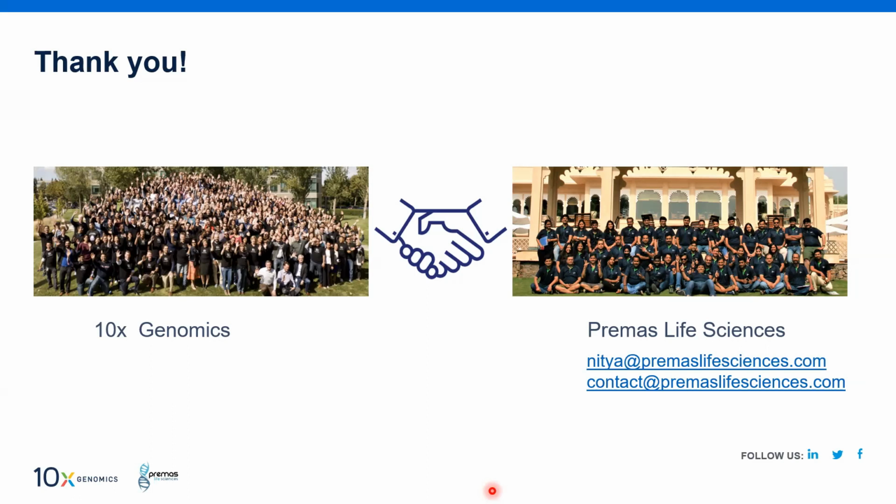To load 1000 cells, you need at least 3000 cells in the total sample. So that limited sample can be done. Otherwise, at minimum, I will say 5,000 cells have to be there so that you can start off your experiment.